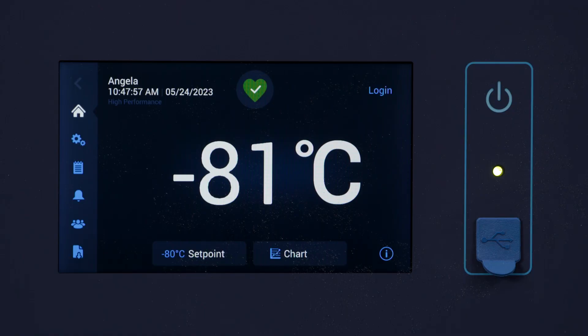Today, my desired temperature is minus 80 degrees Celsius. I'm going to follow a recommendation from the USP that my samples can be stored within a range of plus or minus 10 degrees Celsius. That means I need to store my samples between minus 70 and minus 90 degrees Celsius.